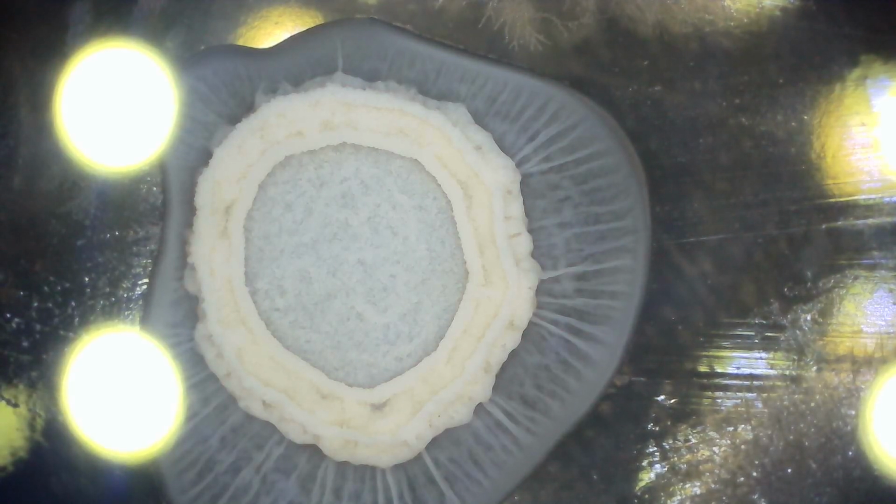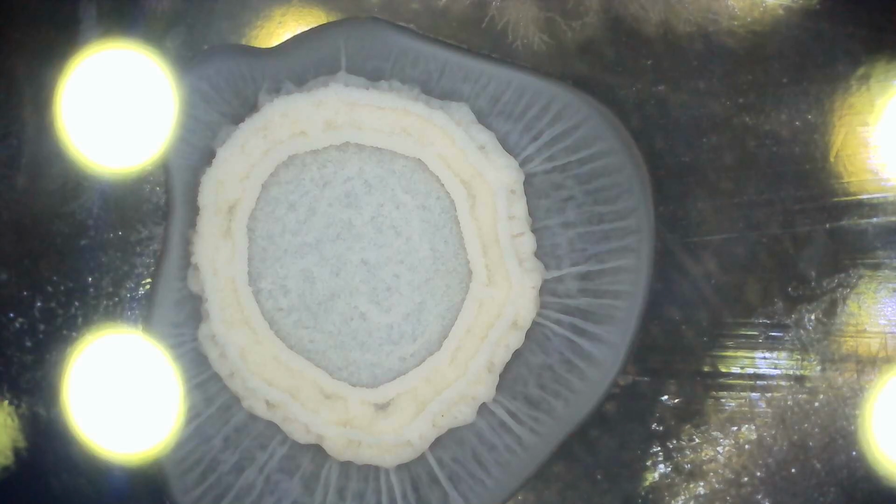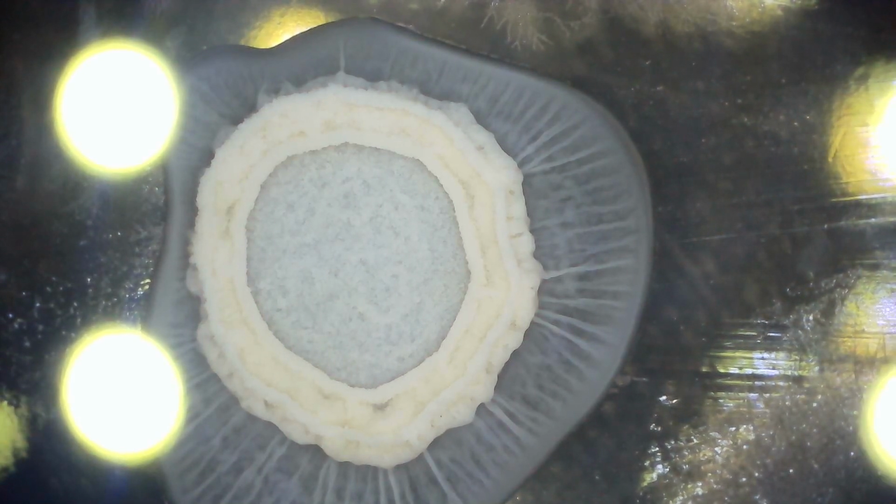So this is the cool fungus that's growing in the mum's keyboard Petri dish. I think it looks awesome. It's got this little crater in the top and this white wrinkle around the outside and there's little sort of fingers growing out from there. I think that looks great. We've got this sort of amorphous fuzzy blob here. That one's less interesting to look at.